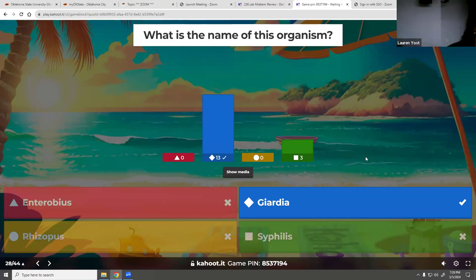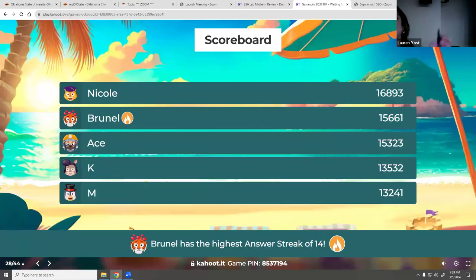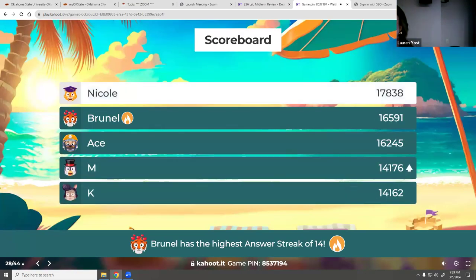That will be one of the options for your choices, okay? But what you will see is one that looks kind of similar to Giardia. It's a little bit larger, and it has flagella for sure, and it is pink in the stain color, from what we looked at, okay? And it is called Trichomonas. That's what you're gonna see, Trichomonas. All right, that's what you get for sticking around for the lab review.